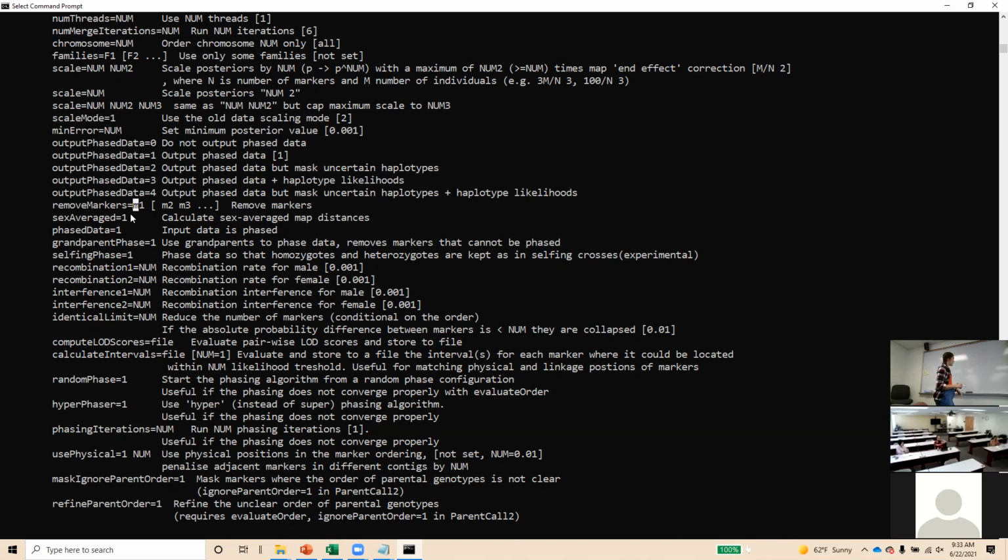and that would not be a good map to use for QTL analysis. And so I'm just saying, running sex average versus not sex average, it's not going to change this, like it's not going to make this shape any different, but it'll let you know whether you're getting rid of all of the informative markers for one parent or the other parent. It's just additional information that you need to be aware of when you're selecting markers to keep or to get rid of in order to get a better map.